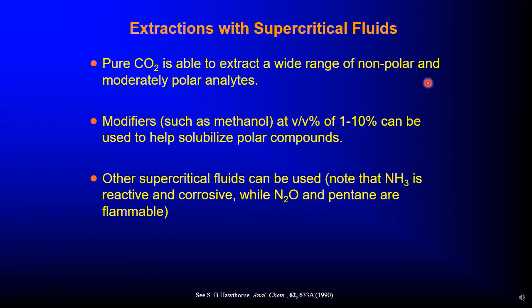So for extraction with supercritical fluid, pure carbon dioxide is able to extract a wider range of nonpolar and moderately polar analytes. Modifiers such as methanol can be used to help solubilize polar compounds. Other supercritical fluids can be used. Note that ammonia is reactive and corrosive, while nitrous oxide and pentane are flammable.